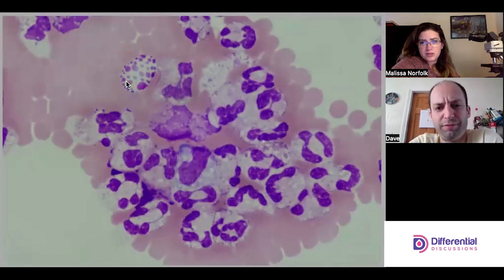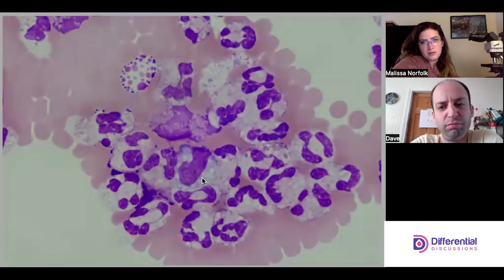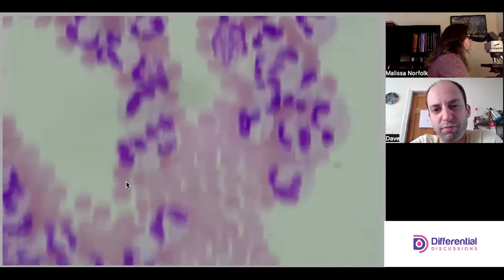With the fine focus I don't really see any more crystals, but we've already seen them so we know they're there. There's a nice monocyte. Let's look at one more field and see if we see anything else.